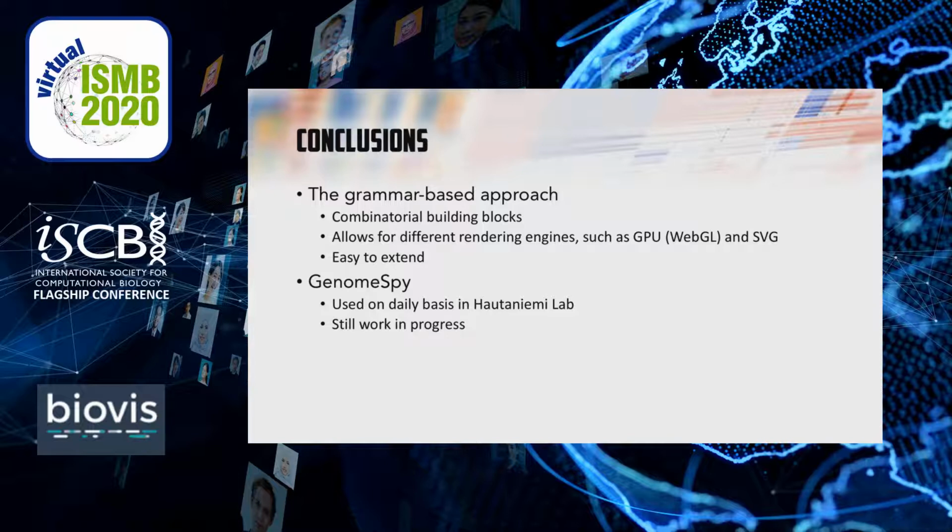GenomeSpy is used on a daily basis in our lab. Although it is still work in progress, it may already be useful for others as well.